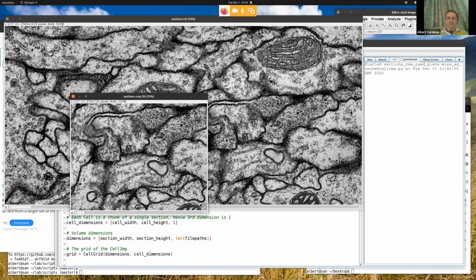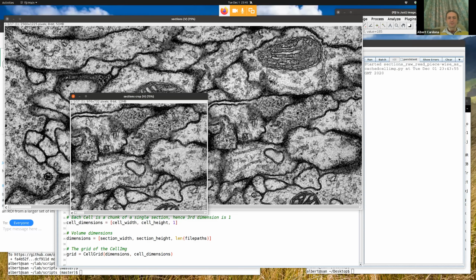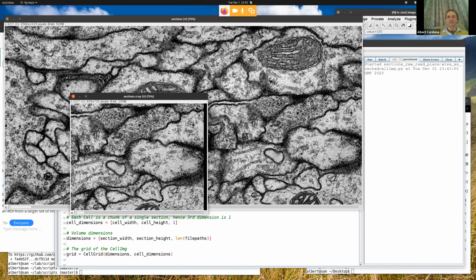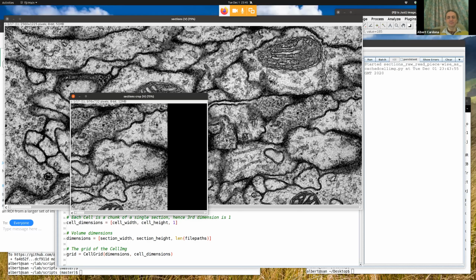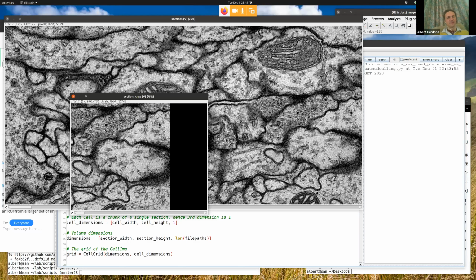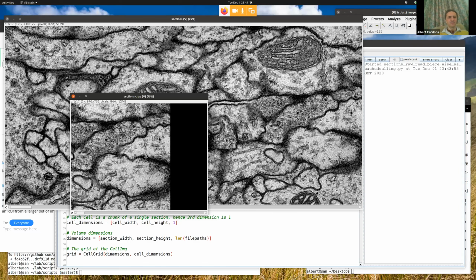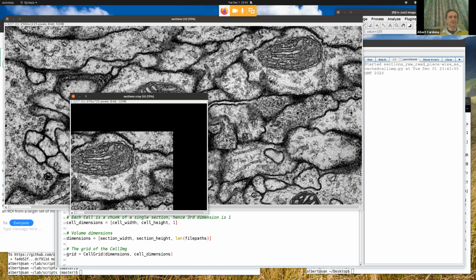rest. And then what you can do, using control and the arrow keys, is load dynamically the rest of the image. And as you reach the edge of the image, it starts being black. Because essentially what you have in here is an infinite canvas that, in the interval where the original image is defined, paints the pixels of the image. But outside of that interval, it paints black.